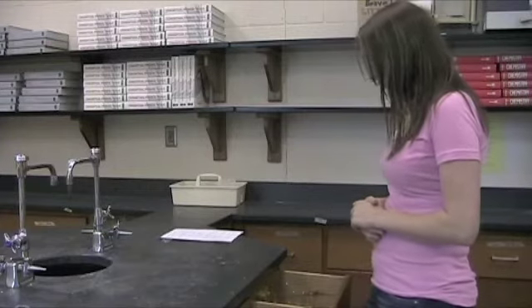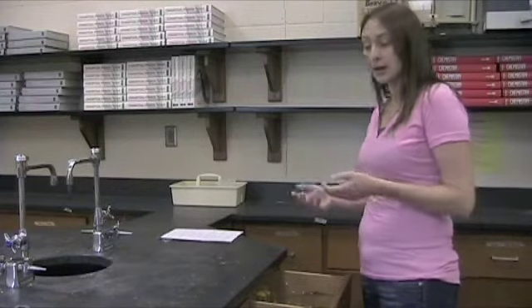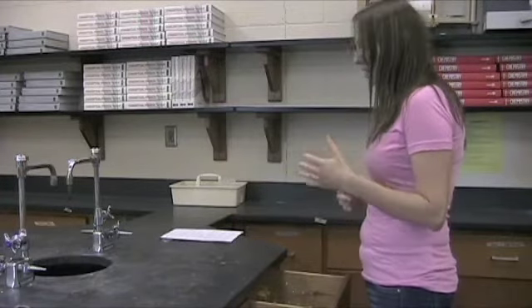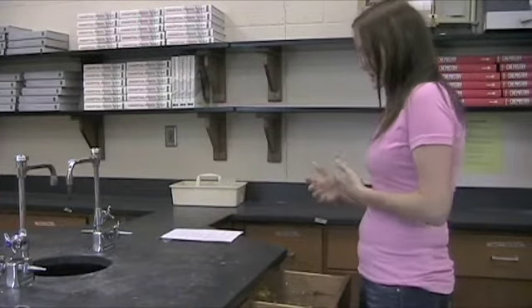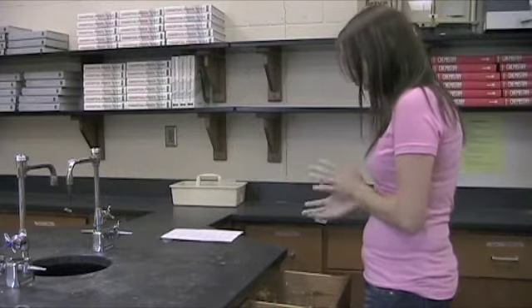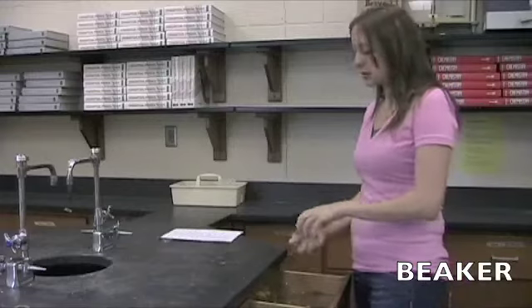So let's start with your drawer first because these are things that you'll use all the time and you'll be in charge of making sure that they are staying clean, making sure that if you do break one you let me know, that kind of thing. So here we go. I'll start off with a beaker. These are the easiest ones.